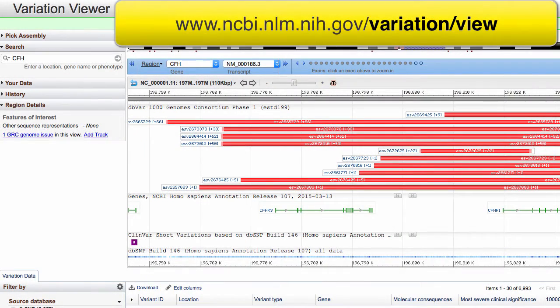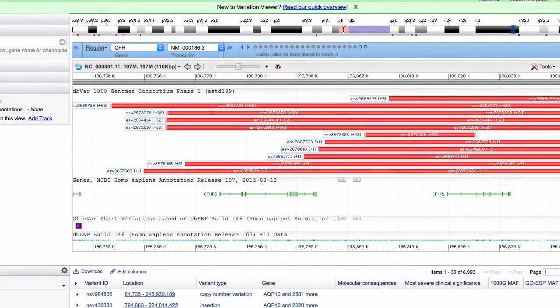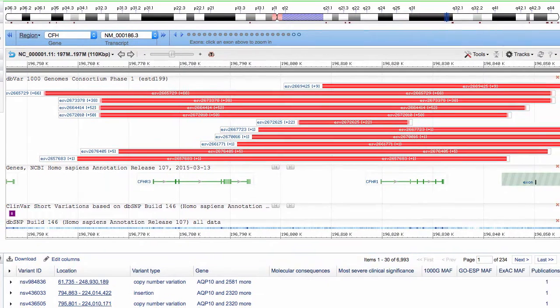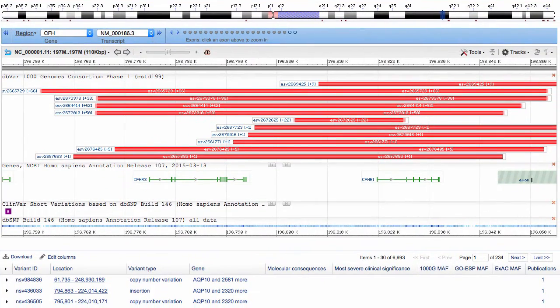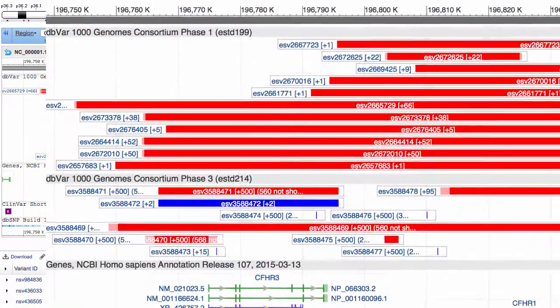Let's start in the Variation Viewer with this view of Human Chromosome 1. I'll move over to the Sequence Viewer section of this page, and focus on this copy number variant.